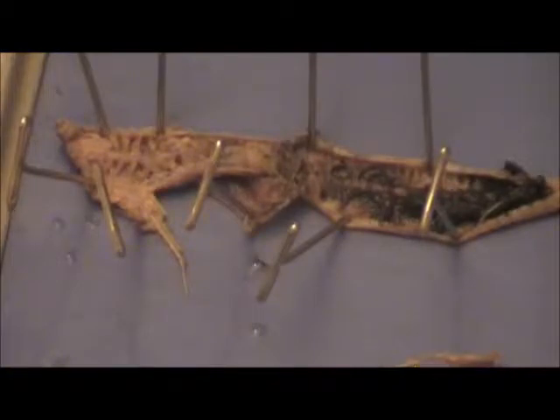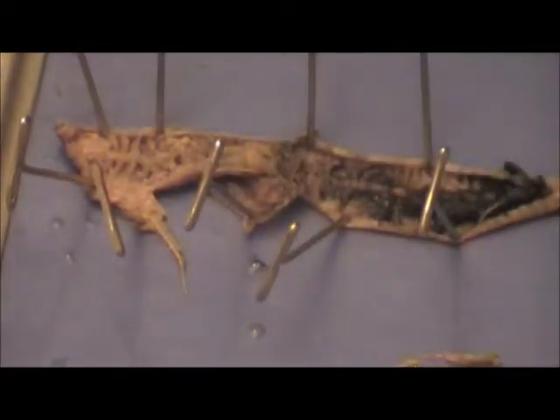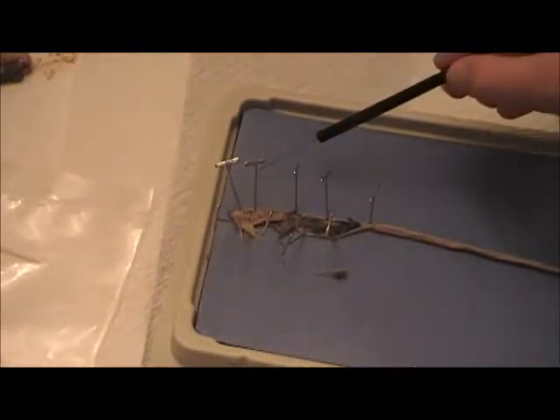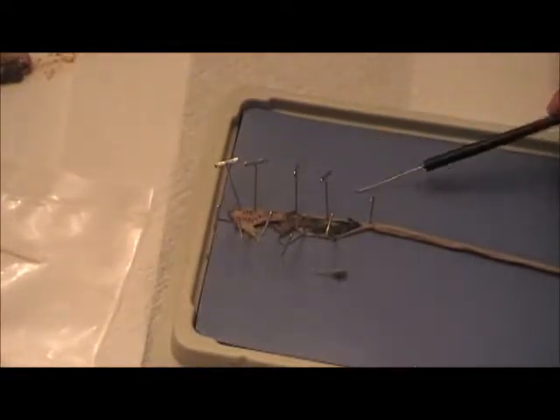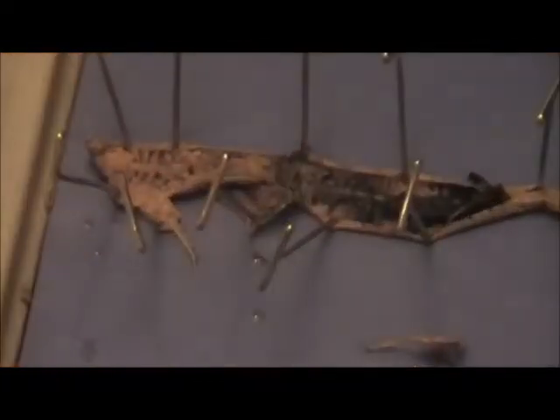Okay, I have the worm open now. So I'm going to start going over some of the anatomy. So, of course, on the very end right here, this is the mouth. So the anterior is up here where all the organs are, and the posterior is down from where the digestive tract is, the intestines. So we're going to go ahead and get started on the internal anatomy.